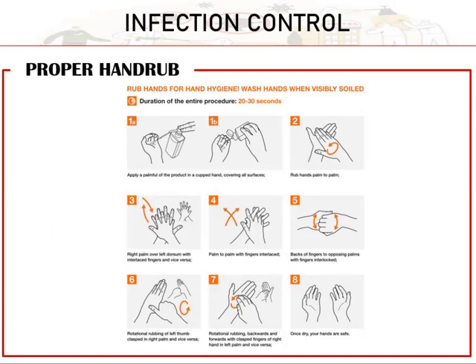So, actually, the same lang yun siya og steps. Ang difference lang yun nila is after the number 7 na steps, we will let our hands air dry. Dili ta magamit og alcohol, dili ta mo gamit og tissue or hand dryer to dry our hands. So the same lang gihapon siyang i-follow na steps actually.